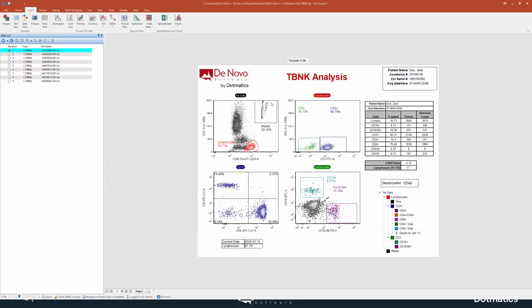So it's really cool. So the first thing I wanted to show are the slider bars that you can use to adjust scaling. So if we take a look at this plot down here, we can see that we're looking at this on a bi-exponential scale, and there is a below 0 point here that can be adjusted. If your plots are set to automatic, which they normally are by default, FCS Express will set this value for you, and it usually does a pretty good job, but sometimes it needs to be adjusted.